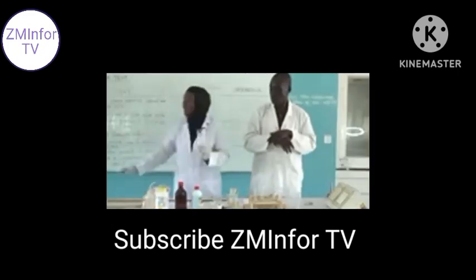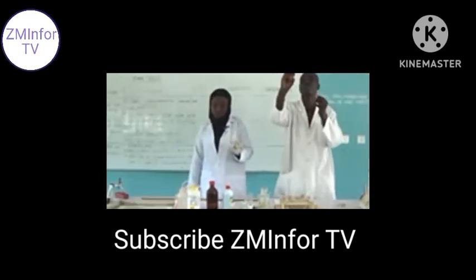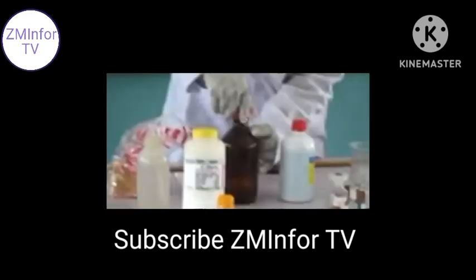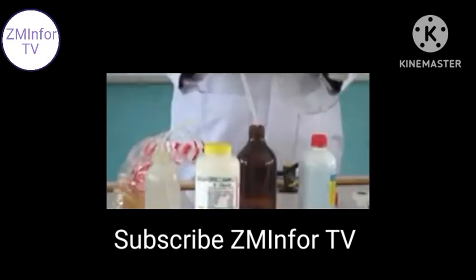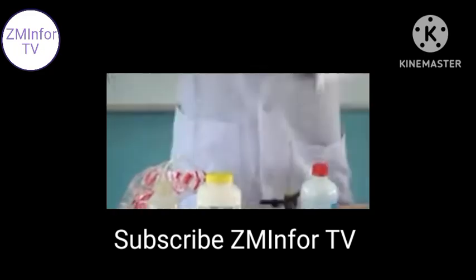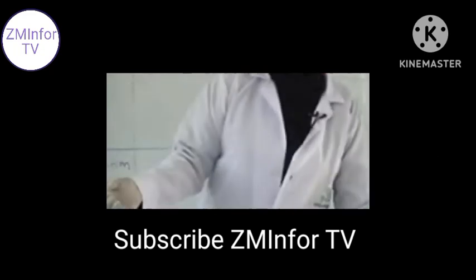And then the instruction is that we add few drops of dilute iodine solution. We have the iodine solution here. We use the dropper to get some few drops. This is the dilute form already.